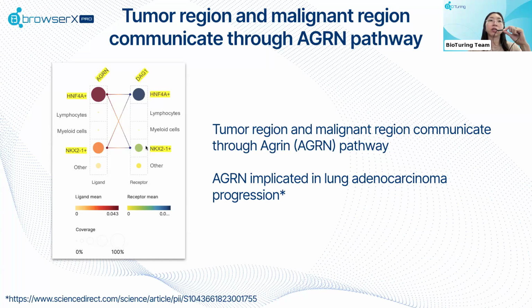These two regions are communicating and interacting with each other via the ligand-receptor pair here. Those are some of the interesting findings I was able to collect from this analysis, building upon the previous SCSE Club episode on Spatial X.